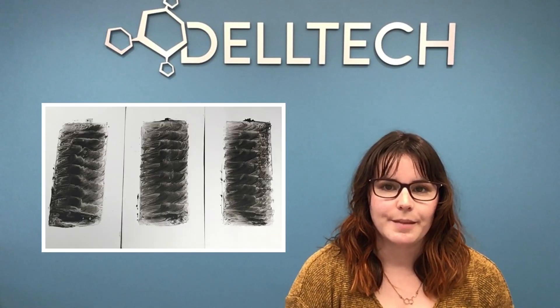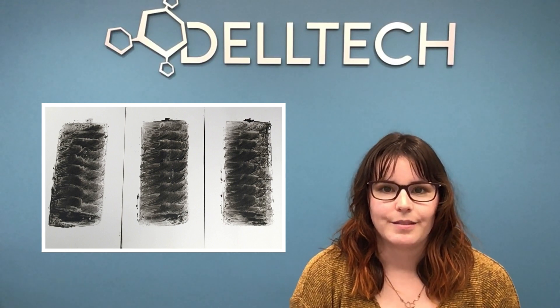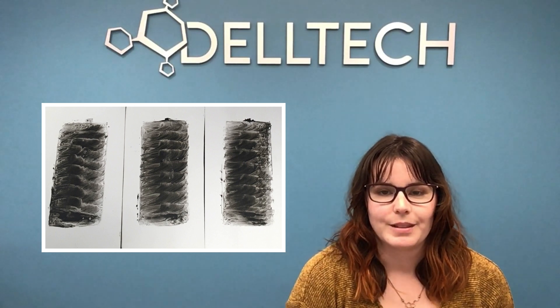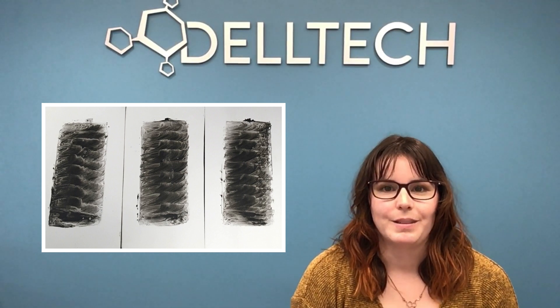The next crucial step is the consistent application of the soil to the test surface. A template frame is used to contain the soil in the middle area of the tile. A precise 50 milligrams of the particulate soil is placed within the frame, and then a paper towel cut to the exact size is wet with 5 drops of oily blend soil and placed over the particulate soil for 10 seconds. The technician then spreads the soil within the frame area on the tile surface. Finally, these tiles must be allowed to air dry for 24 hours before the cleaning test can occur.